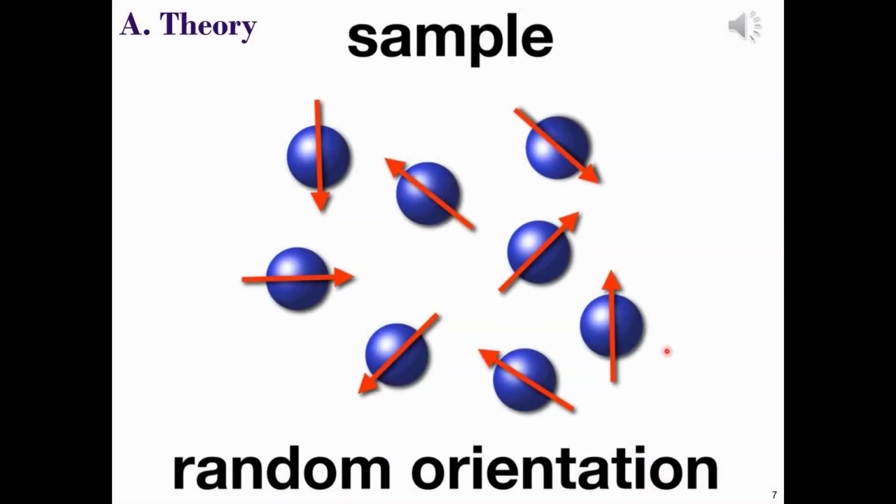So, the protons of a sample organic molecule, that's the hydrogen atoms, remember, each behaves like its own tiny magnet and will have a random orientation when not exposed to a magnetic field. However, once we put an organic sample into an NMR machine, you're placing each of these tiny magnets into an external field that is generated by the NMR machine. What do you think will happen to each of these protons with respect to that external magnetic field? Pause the video and resume when you have an answer.